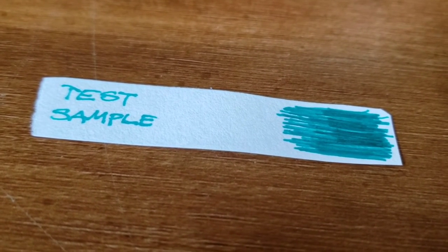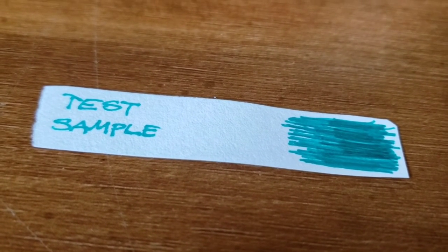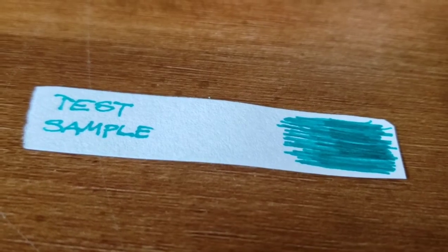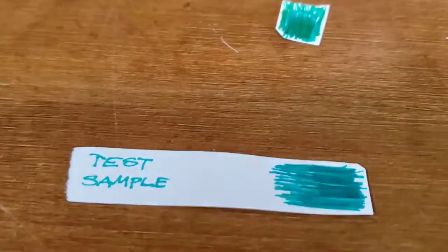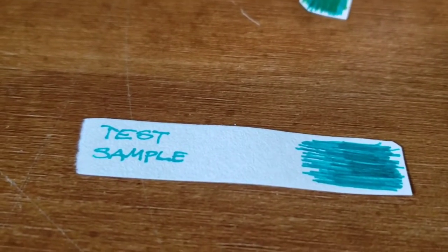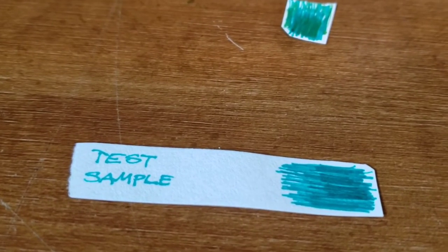It could be a true copy of the ink from the National Mint, or it could be what the actual wrapper of a piece of explosive looks like. And I'm going to test to see if these two came from the same source.